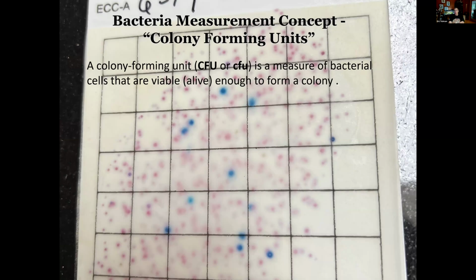But a water sample has been put on this card and it's been incubated. And so separate colonies of bacteria have grown. And the way these R cards work is they're color coded. So the blue ones are the E. coli. And so each of those dots is not just like a single bacteria, that's a colony. So it's a colony forming unit.